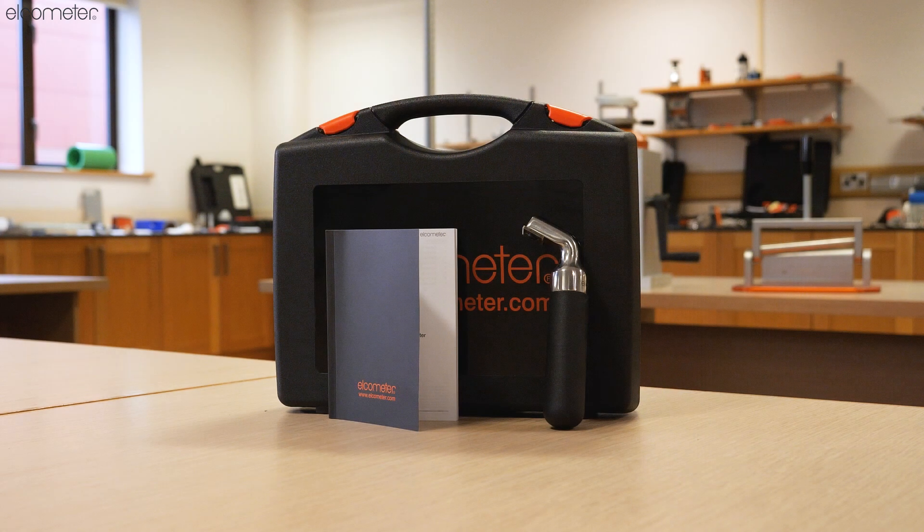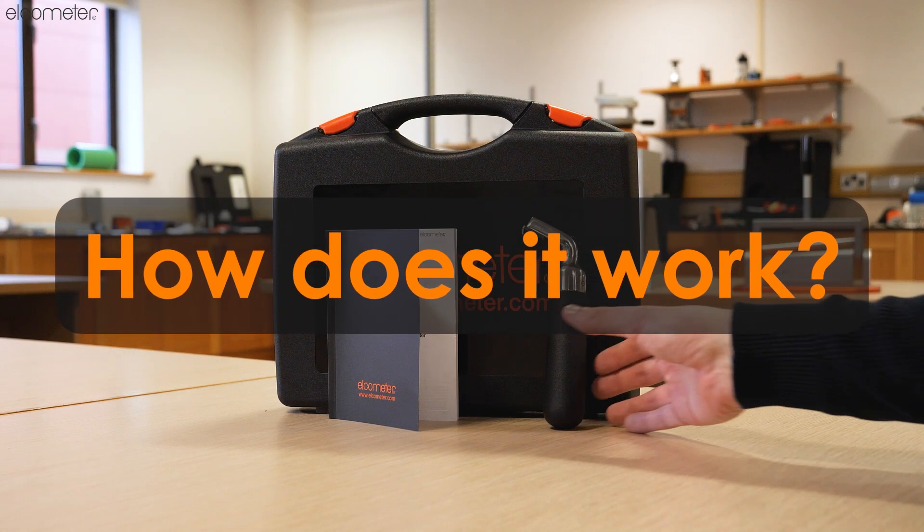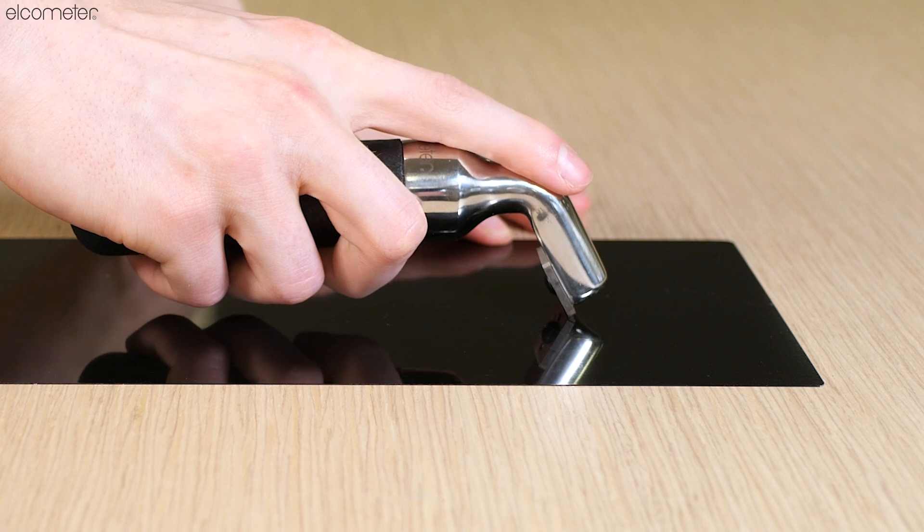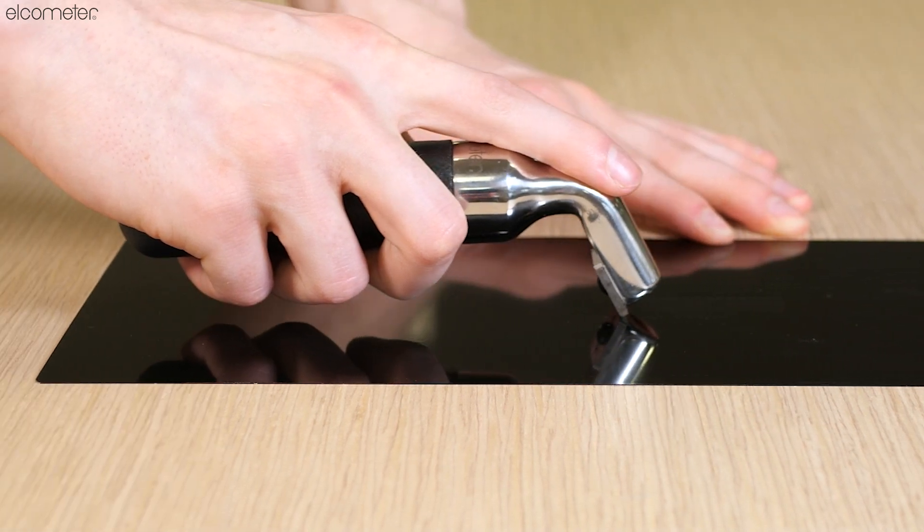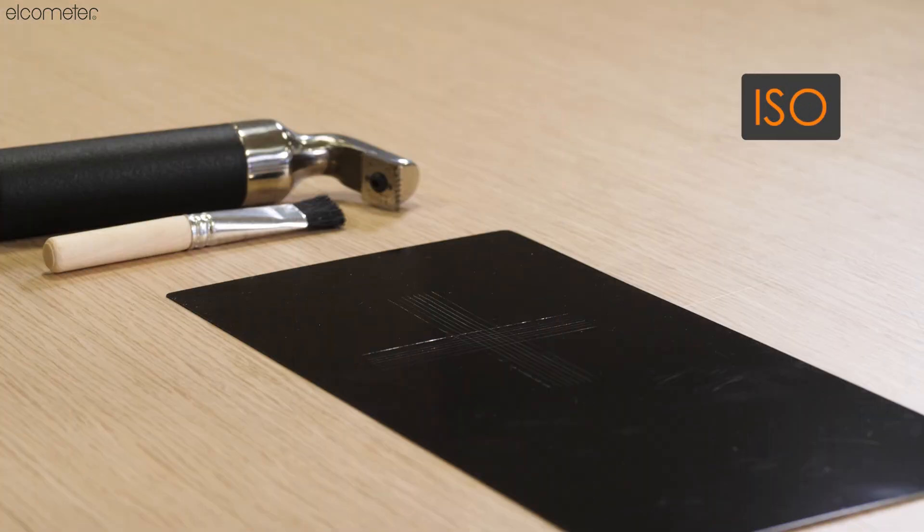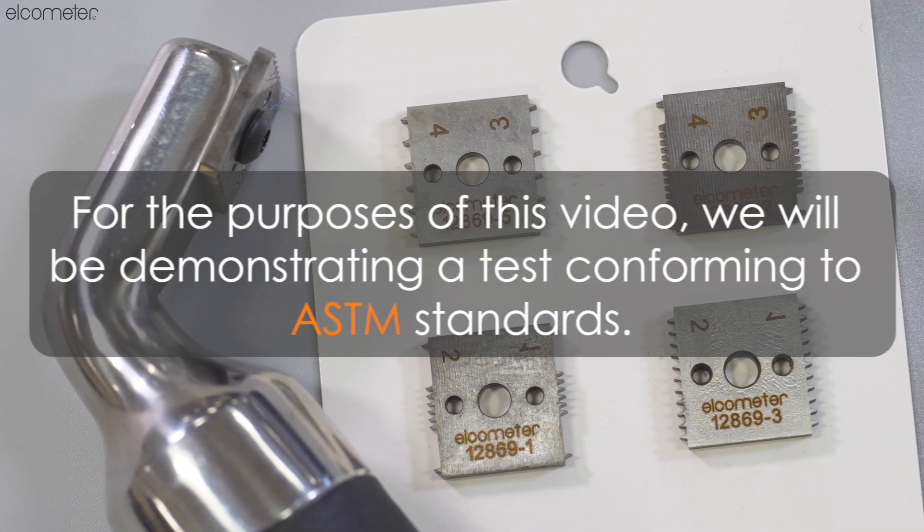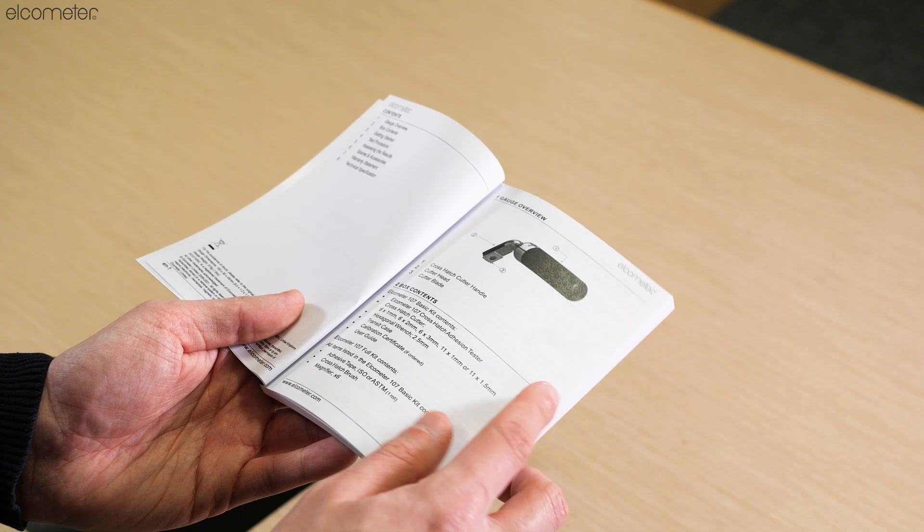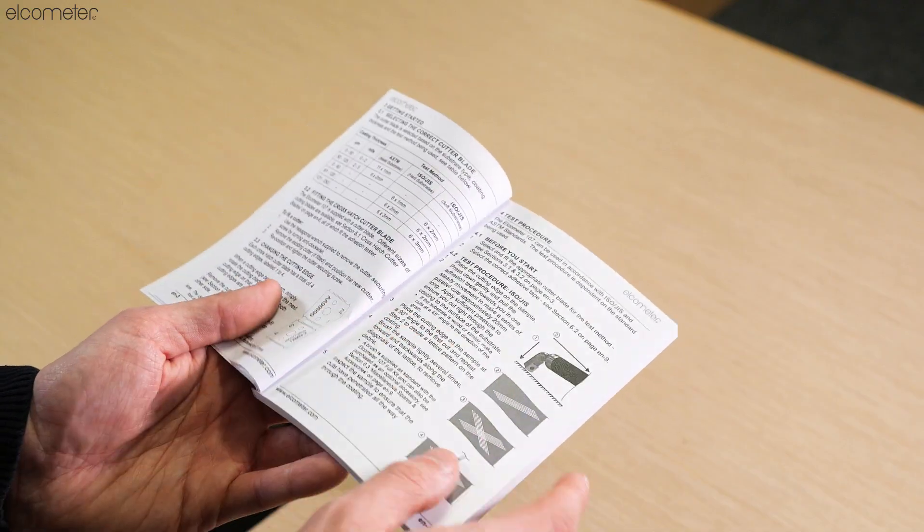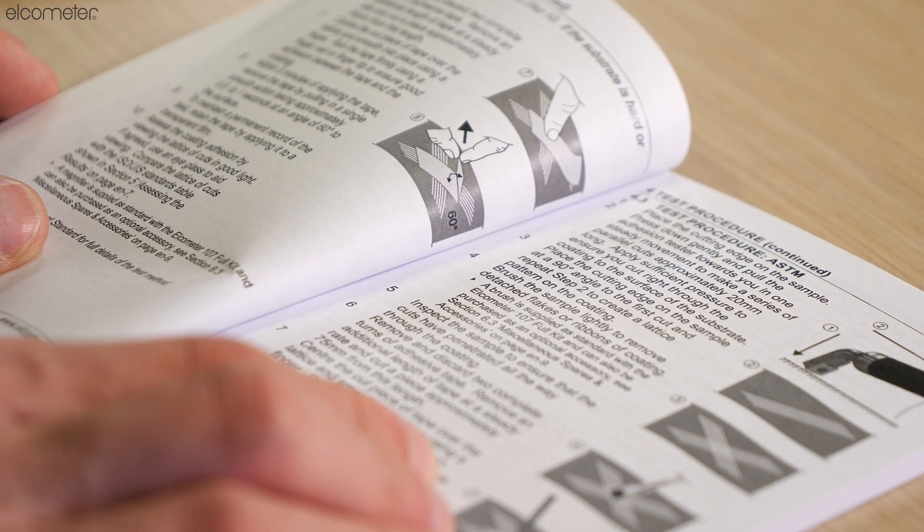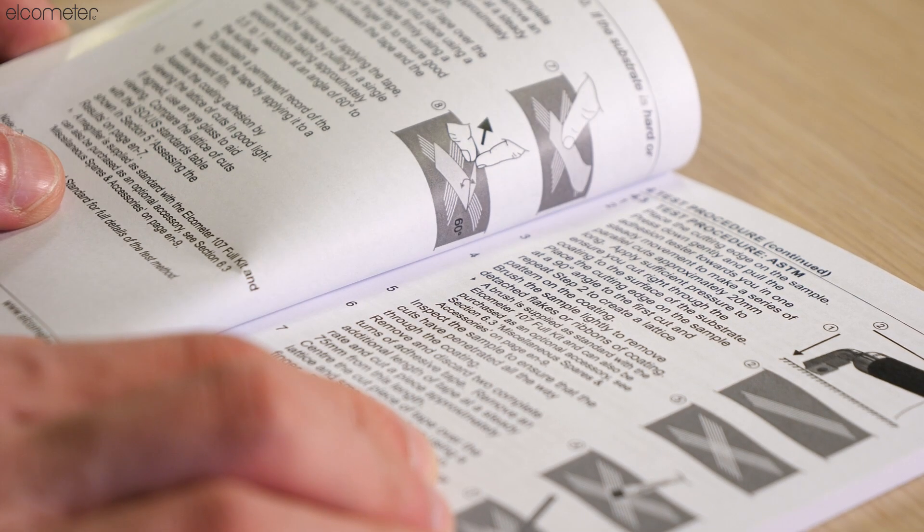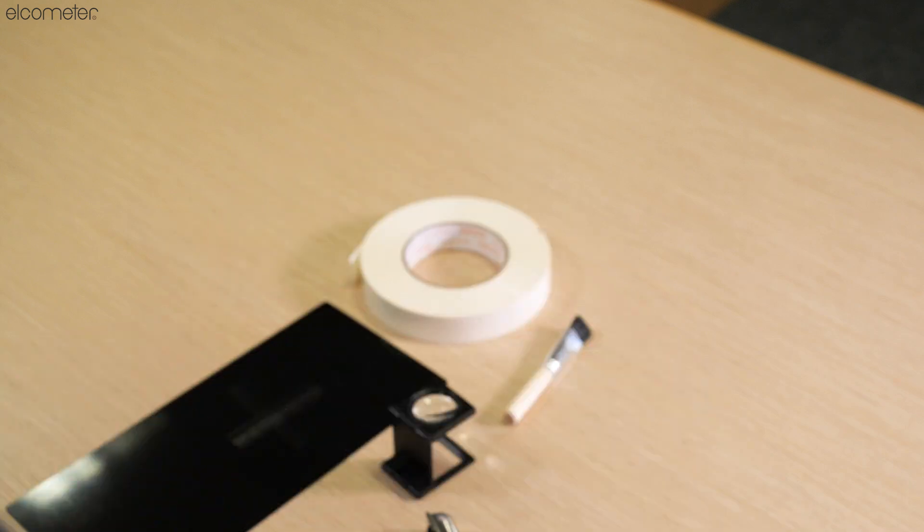So how does it work? A key point to note is that the Elcometer 107 can be used in accordance with both ISO, JIS, and ASTM standards. For the purposes of this video, we will be demonstrating the procedure which conforms to ASTM requirements. If you work towards ISO or JIS, don't worry - variances are minimal and full information on them can be seen in the product's instruction manual.